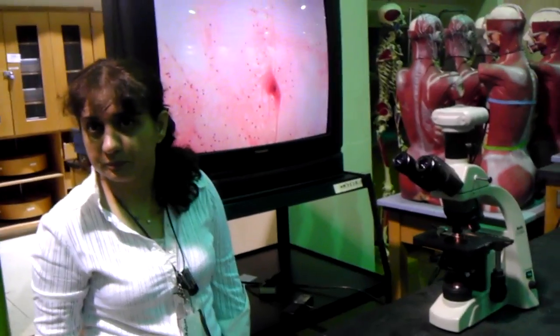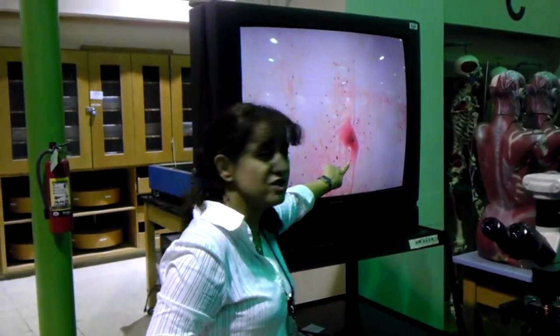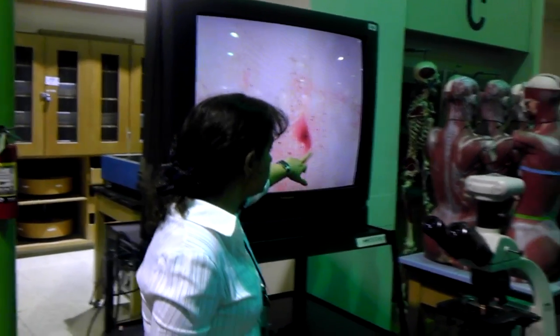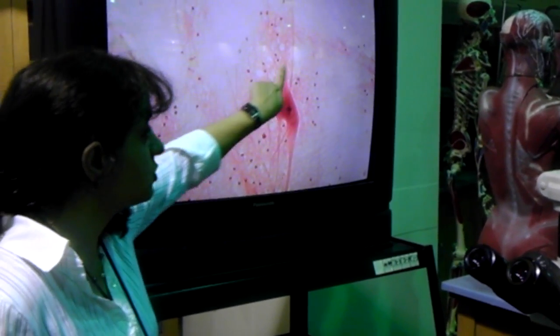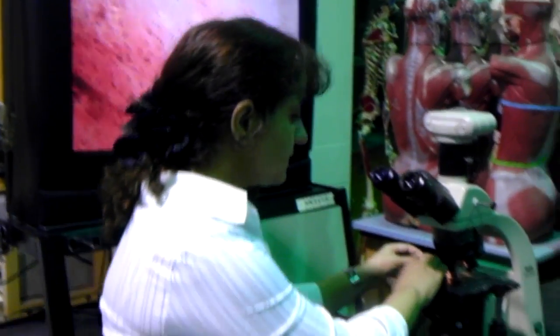How about the initial segment? The initial segment is the first part of the axon. In the slide you cannot say exactly where it is, but it's somewhere here very close to the axon hillock. So the structures you need to distinguish are: this is the neuron, these are the neuroglia, this is the cell body with cytoplasm, all those are dendrites, and this is the axon with the axon hillock. Any problem? The next slide, guys, is the slide with the cross-section of the nerve.